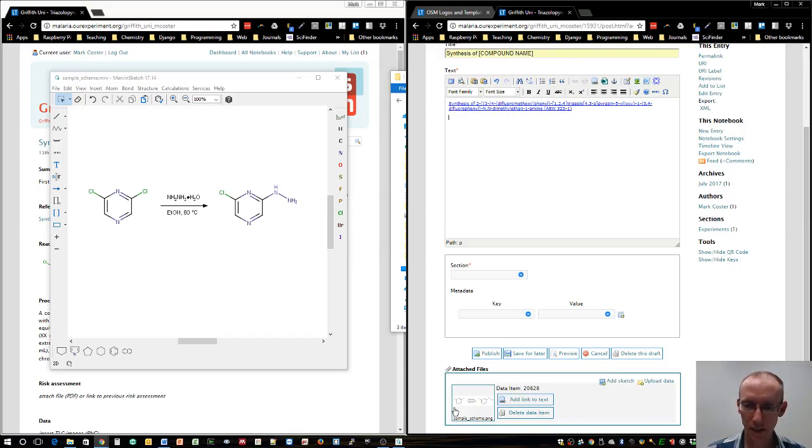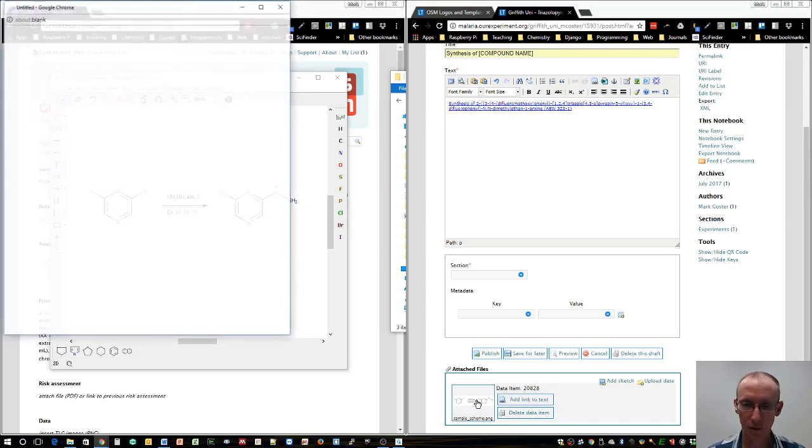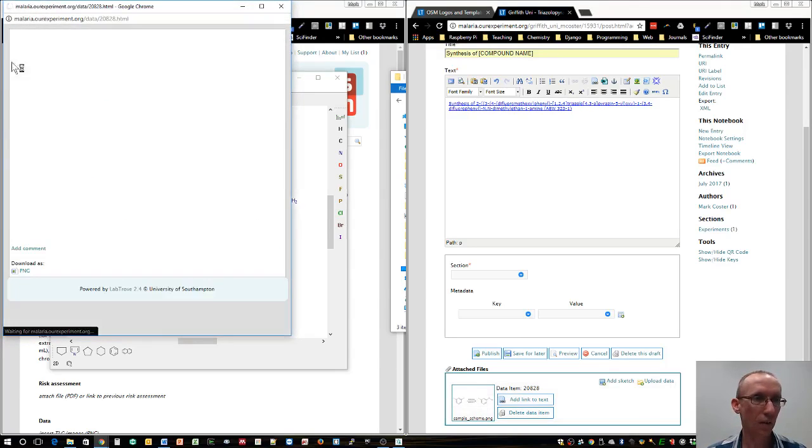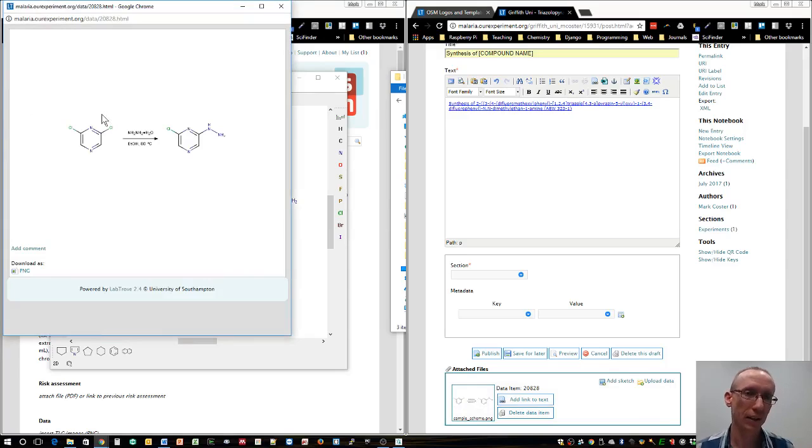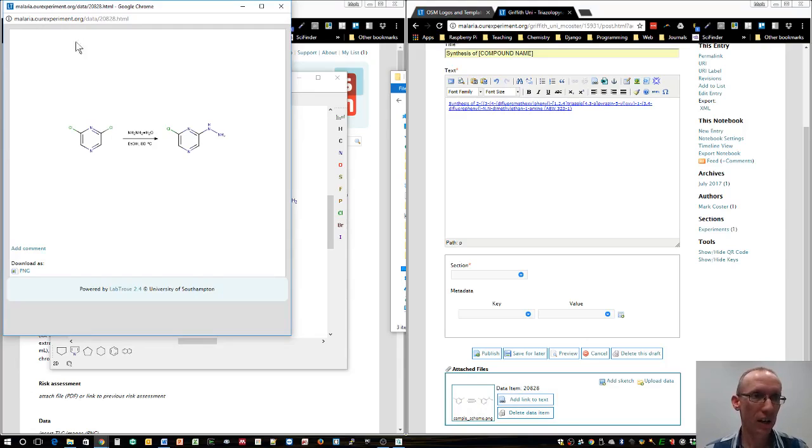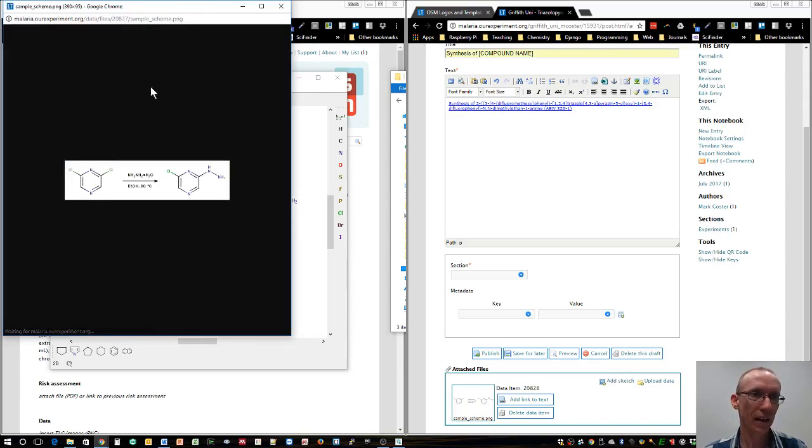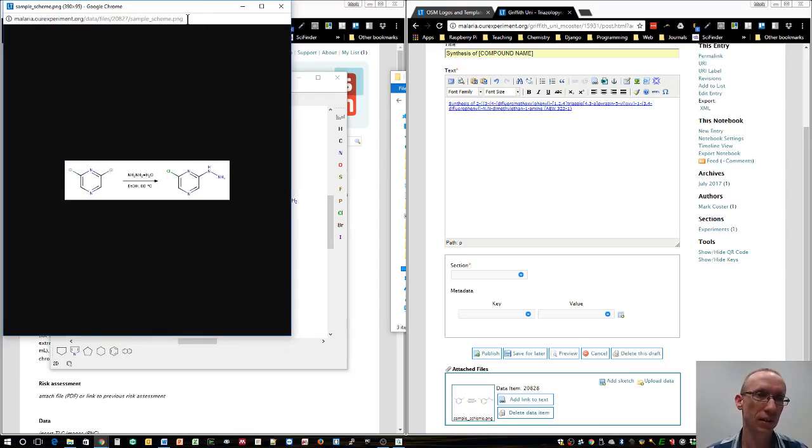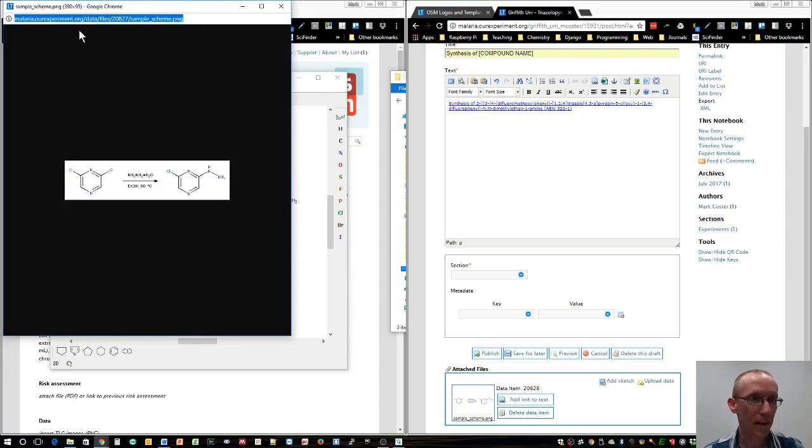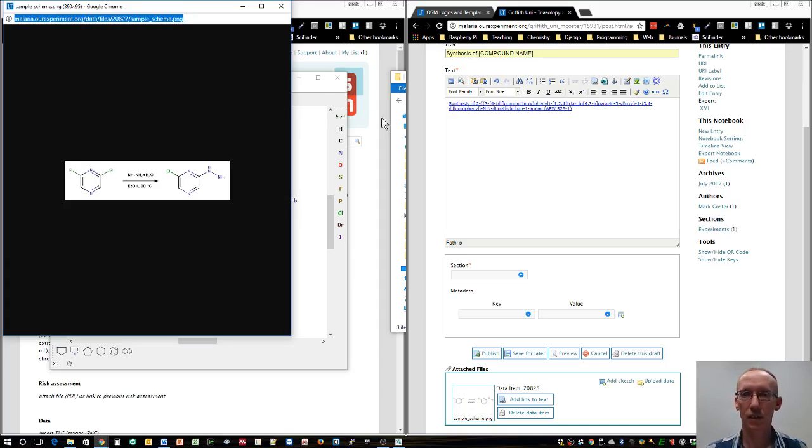Now what we need is a link to that file. It's now on the malariaourexperiment.org site. To get that URL, we need to click on the file we've just uploaded. It'll come up in the box here. But there's one extra trick to get it to appear nicely within our lab notebook entry. We don't just want that URL at the top. We need to actually download it as a PNG file.